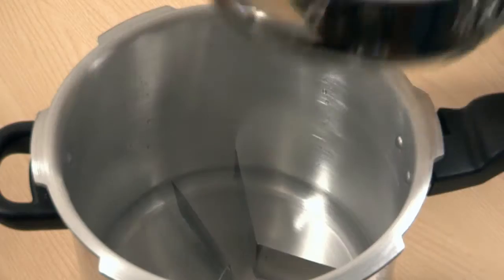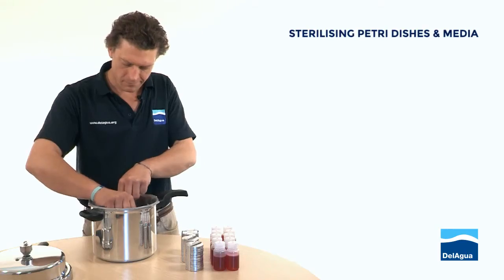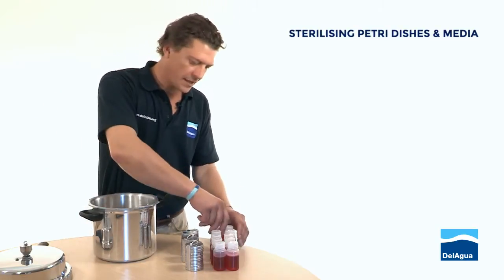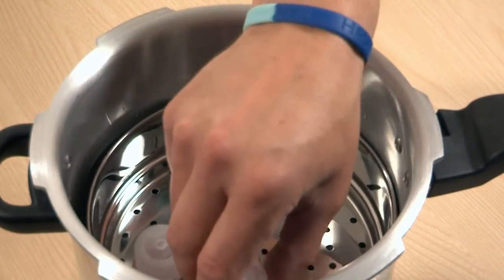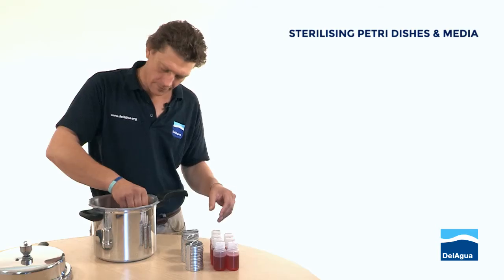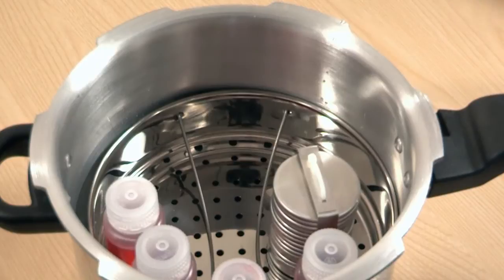We replace the load tray on top of the supports, and then carefully, ensuring that the lids are loose so the bottles don't explode, place them into the load tray, ensuring that there's sufficient space for them not to be touching.